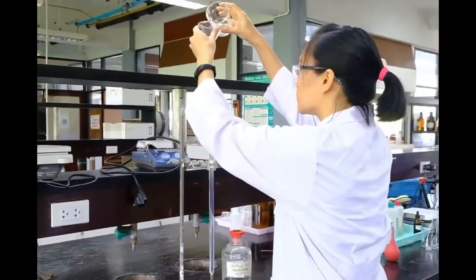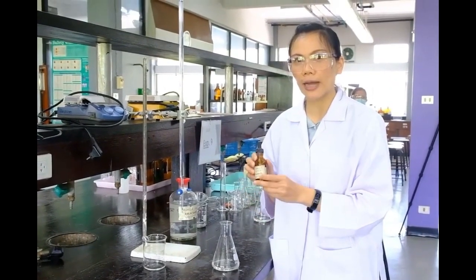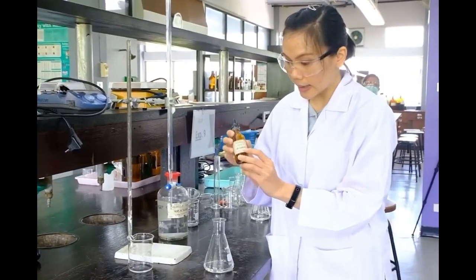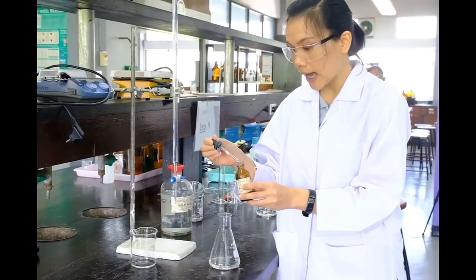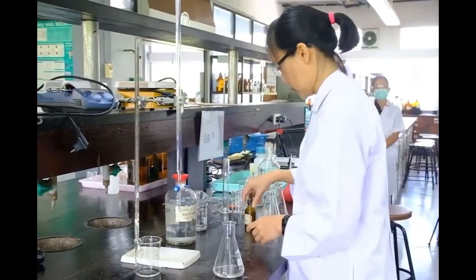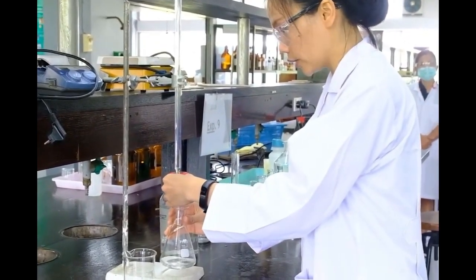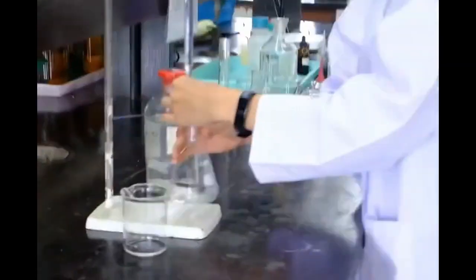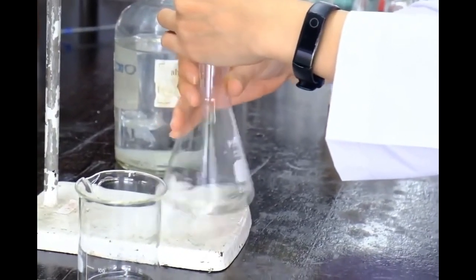For titrating KHP with sodium hydroxide, first have the students add the indicator drops. The indicator used today is phenolphthalein. Add approximately 2 to 3 drops, then shake to mix. Before titrating, slowly add the sodium hydroxide drop by drop, shaking the flask containing KHP as you titrate.